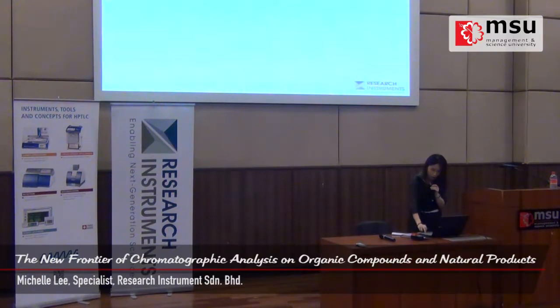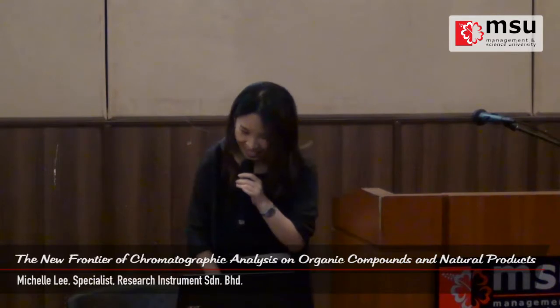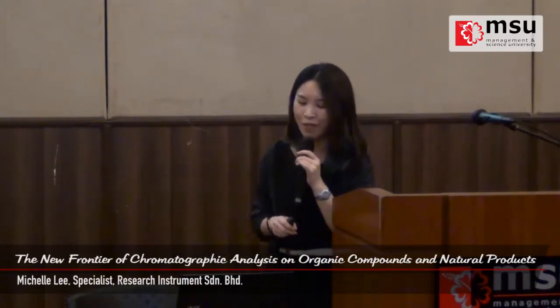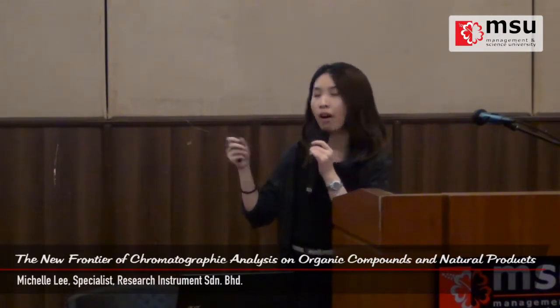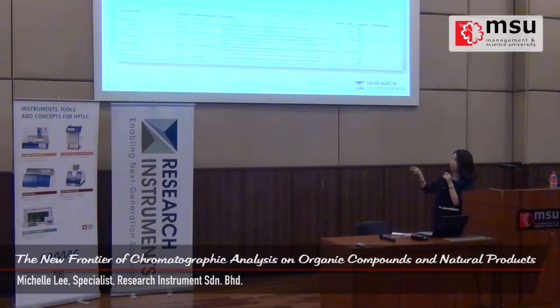So this is heading towards the end already. I hope you're still awake. Alright, so just to share with you, with our software there's actually some method library, because Camag in Switzerland have already tested various kinds of natural products. So they actually have some of the methods. So for example, over here, you have the different Latin names of the samples, and then you actually can click download on their method.